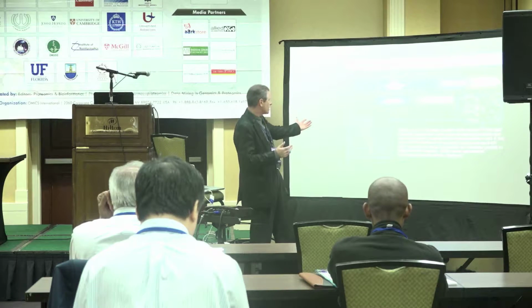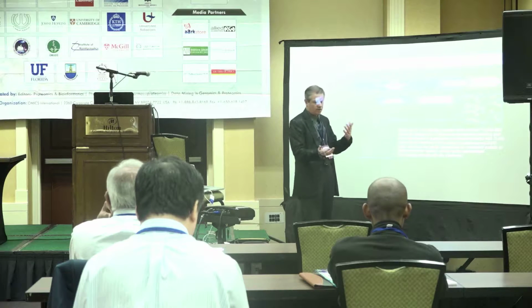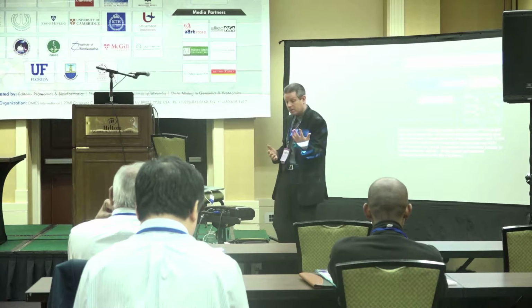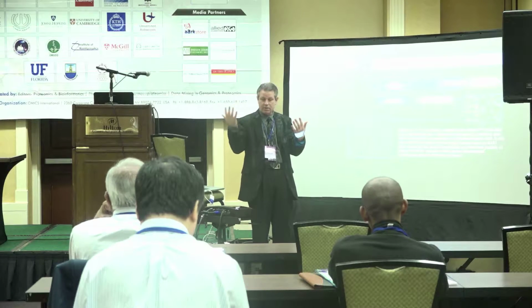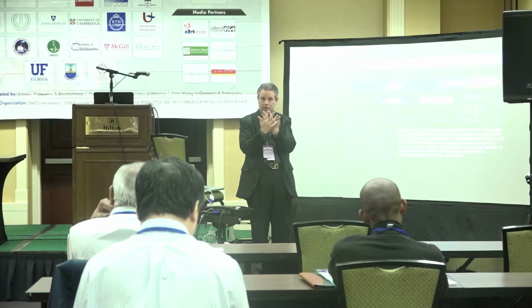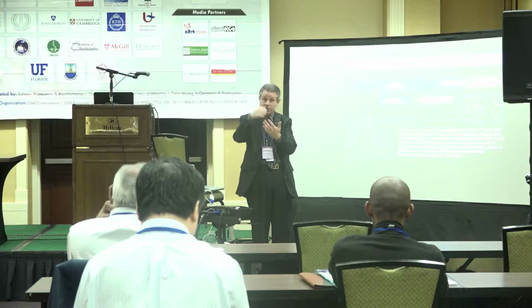And we can take these images and focus in on one little part of the grid and take a control sample, colorize it blue, for example, and take a treatment sample, colorize it red, and then overlay the two grids. Whatever is white is unchanged, whatever is blue has gone down, and whatever is red has gone up.